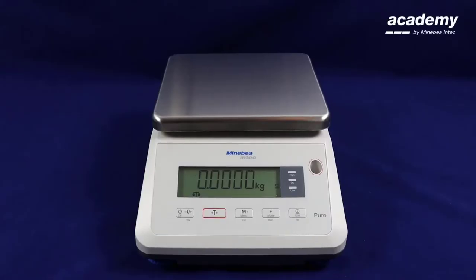Hello and welcome to Puro. In this video we will be demonstrating the check weighing application. The purpose of this application is to check whether sample weights correspond to a specified target weight.